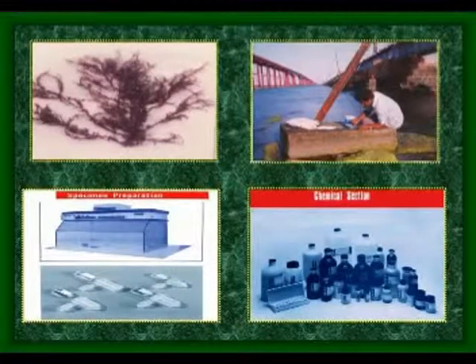For example, first you have to prepare a buffer solution. This buffer also varies depending upon the nature of the materials. For example, in the case of algae, you have to select cacodylate buffer. For the rest of the specimens, generally we use phosphate buffer. So first you can take any one of the buffers. For example, I will tell you the cacodylate buffer. How to prepare the cacodylate buffer?